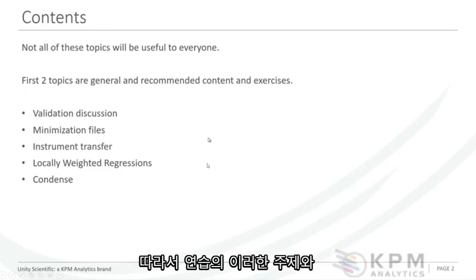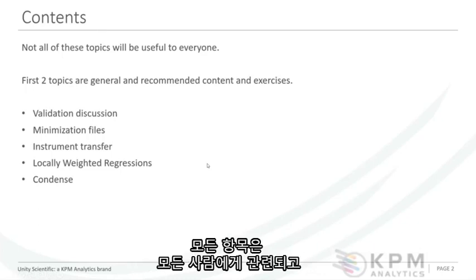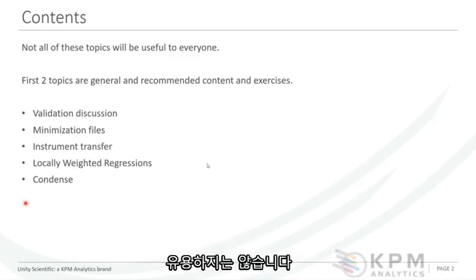For these topics and exercises, not all of these are going to be relevant and useful to everyone. The first 2 topics are really general, and I recommend that you for sure, at least in this lecture, listen to the first 2. And there are some exercises along with the minimization files. This can really be helpful to your calibration development. The remaining 3, most people will not use.